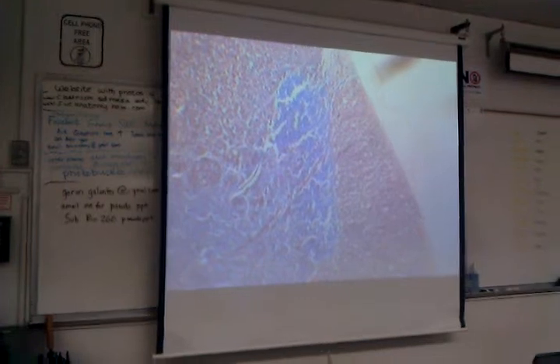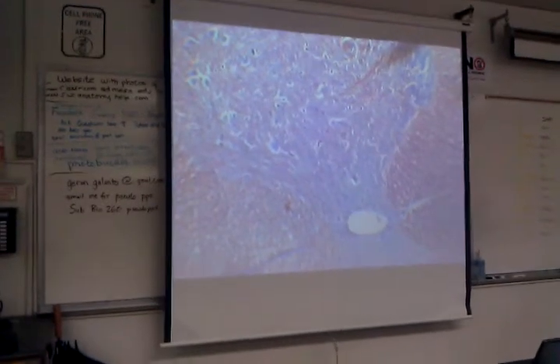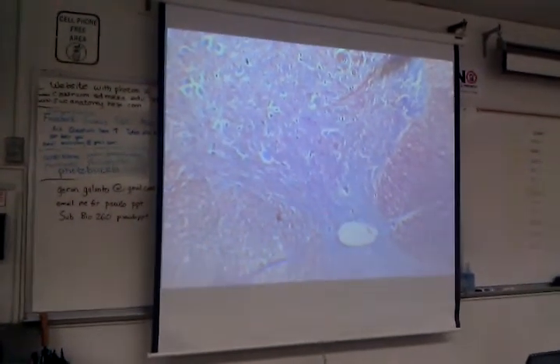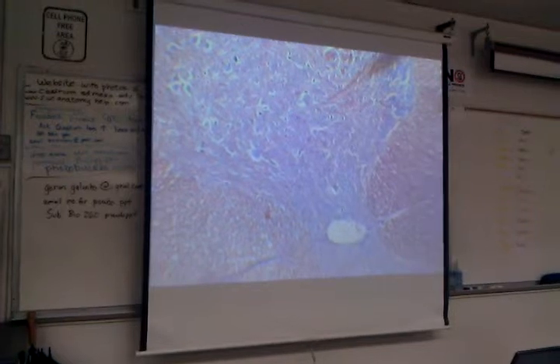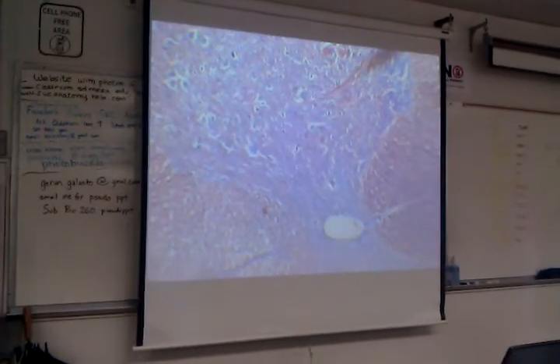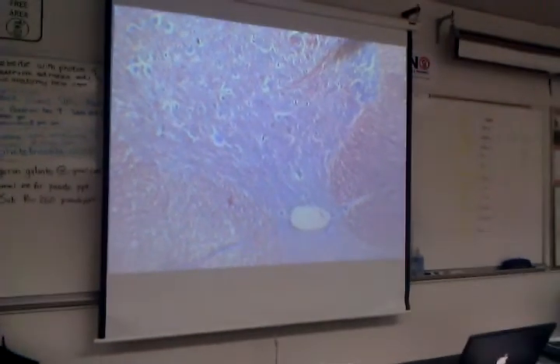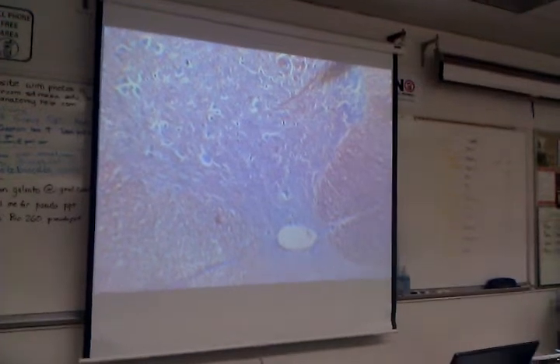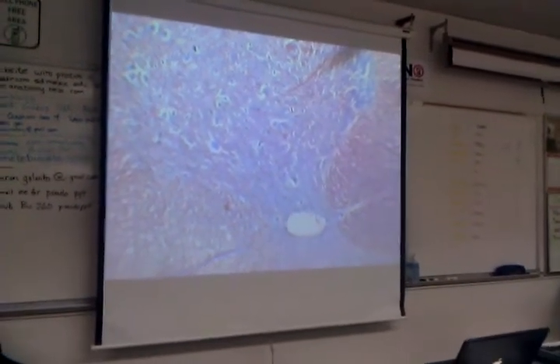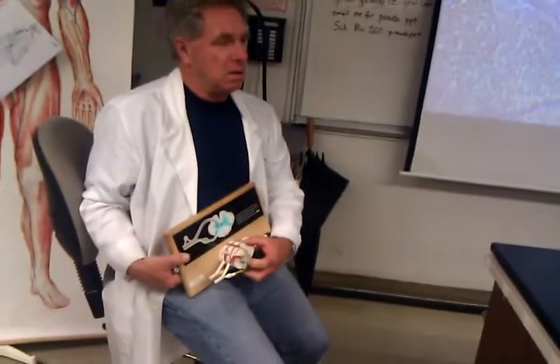Now, remember the horn looks like little wings of a butterfly. So if we get into this position, there's the central canal, right? This stuff, top and bottom, around the canal, the connection between this side and this side, is the thing they call the gray commissure. And right in here would be the lateral gray horn, kind of the middle, sort of right here. And then the ventral gray horn is going to be right here.